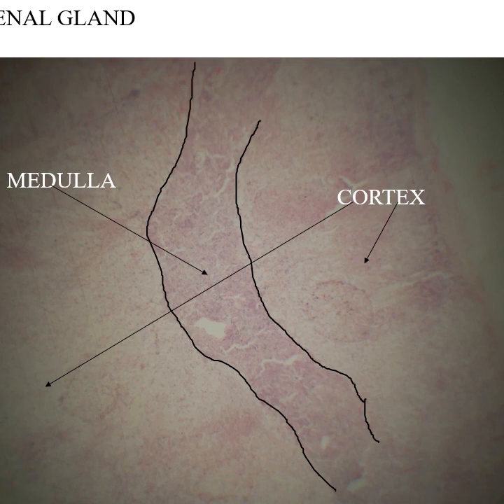And what you notice, this area I'm highlighting is a little darker than the rest. That's the adrenal medulla. Then out here, around it, all the way to the capsule there at the edge, and out here, goes off the screen, that's the cortex. Again, the cortex secretes, I think we mentioned aldosterone, cortisol, and some androgens, male sex hormones. The adrenal medulla secretes epinephrine, norepinephrine, which reinforce the fight or flight response.